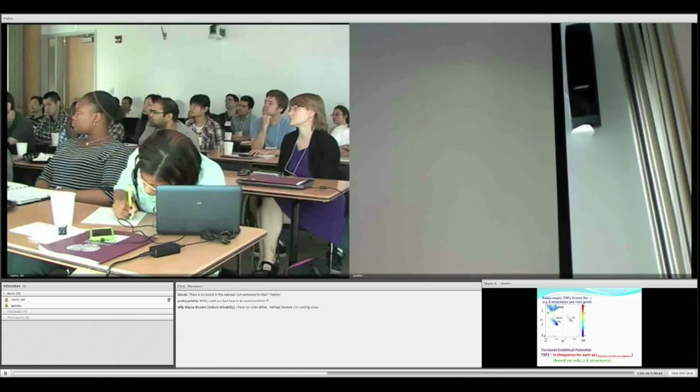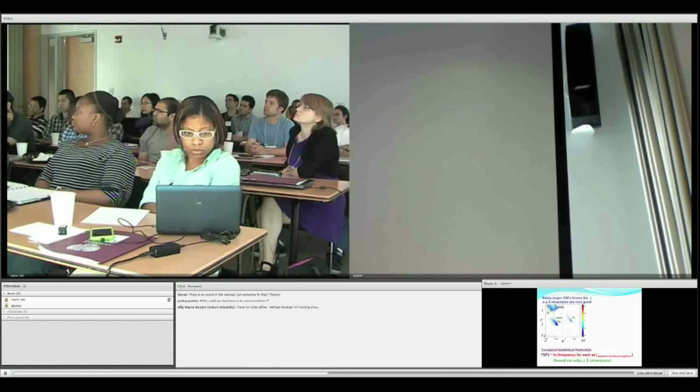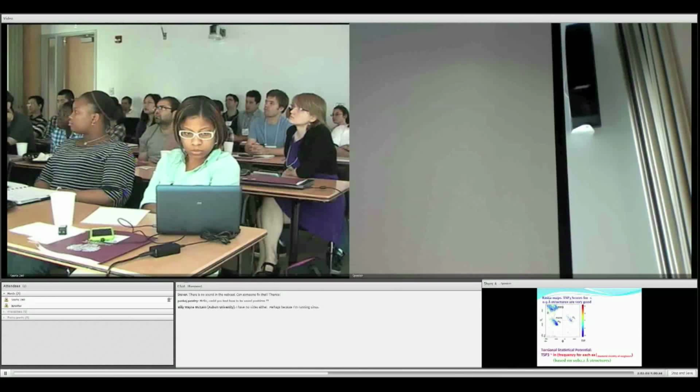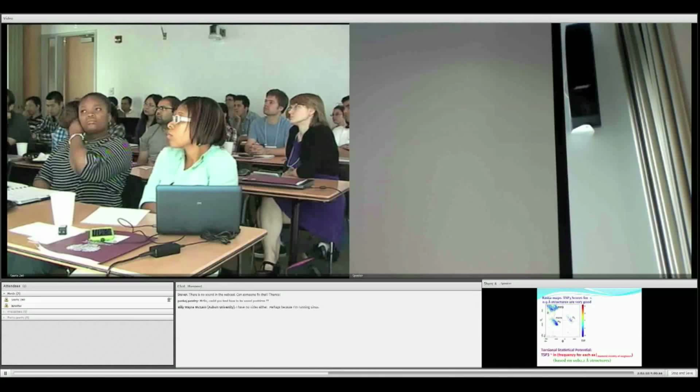We also have another addition which also includes the secondary structure. If you take into consideration the secondary structure of this triplet, that would also be limited, but in this case I consider all. AAA means all. So we call this TSP3.